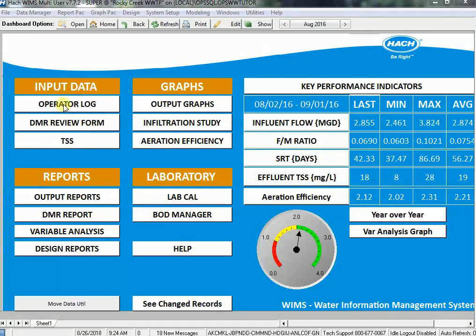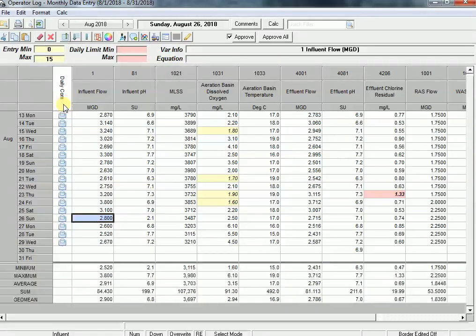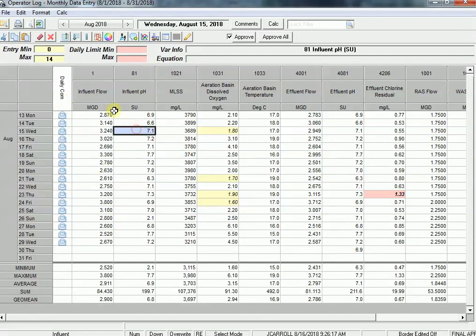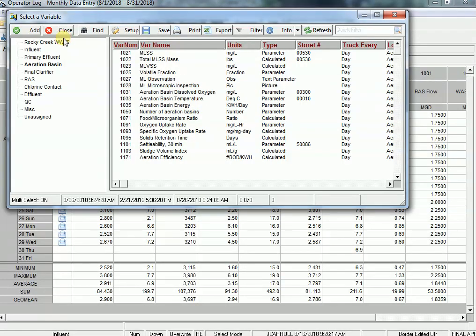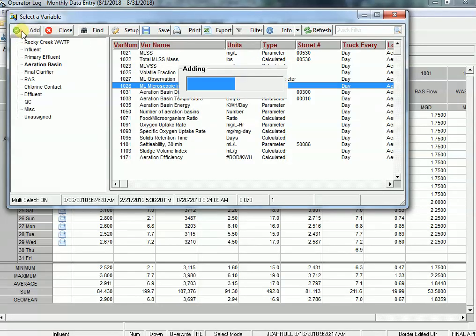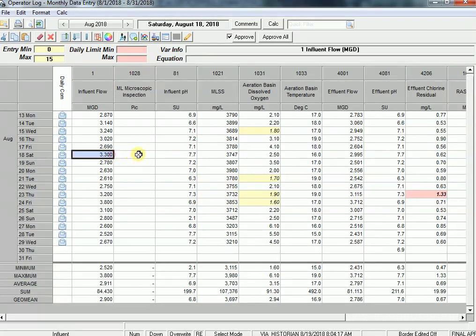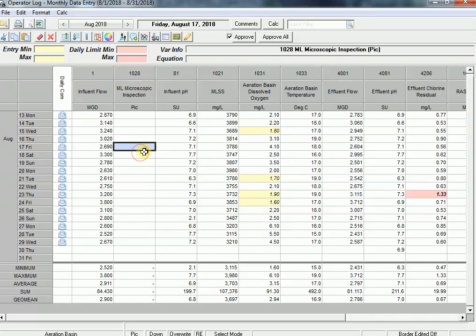I'm going to bring up my operator log to start entering some of this data. So I have my form. I'm going to come in here and insert a new column. I've got this variable right here, so I'm going to click Add. So I've got a picture, no data yet.